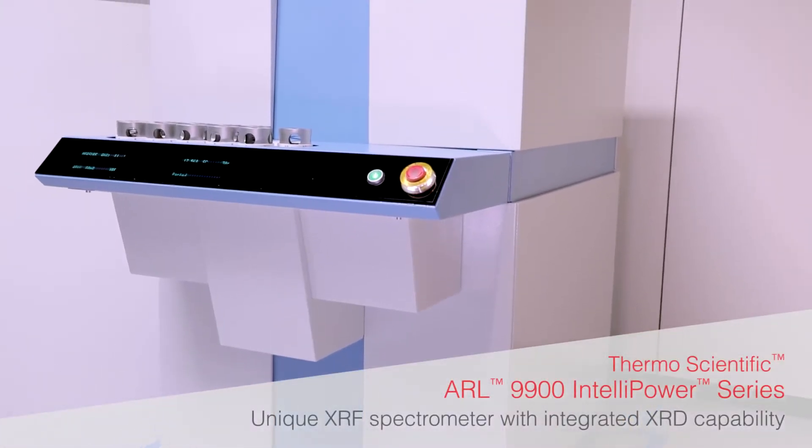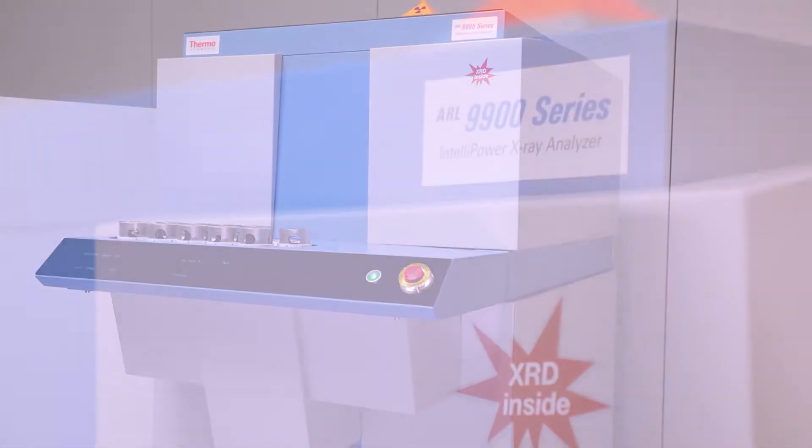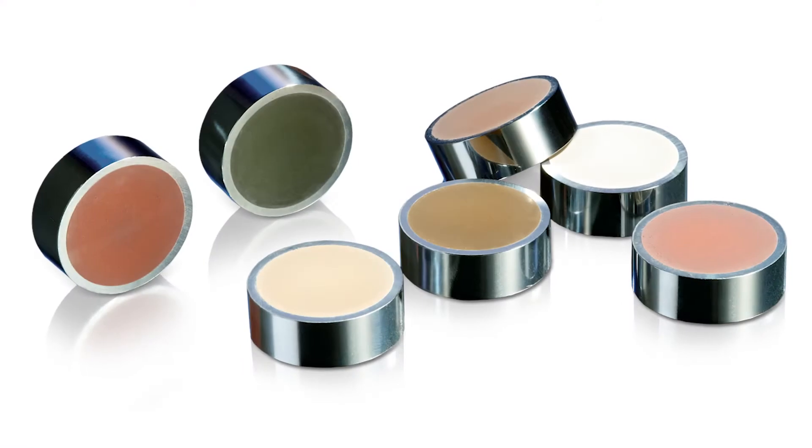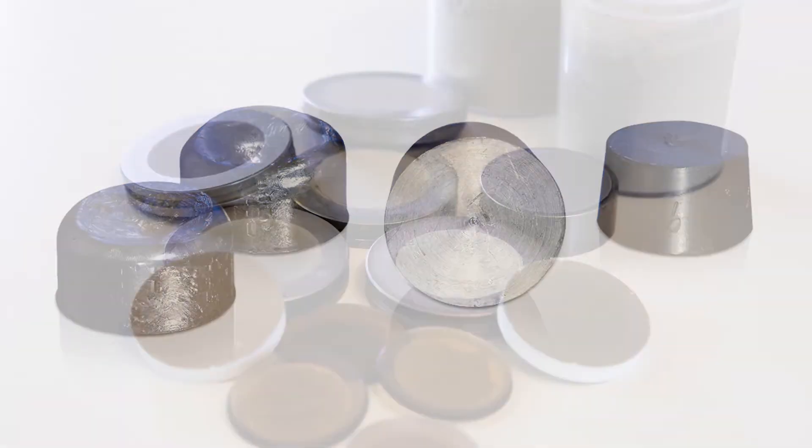The Thermo Scientific ARL 9900 IntelliPower series of X-ray spectrometers is the most capable and versatile ever offered for process control. The ARL 9900 enables the rapid and accurate analysis of solid samples of various kinds.